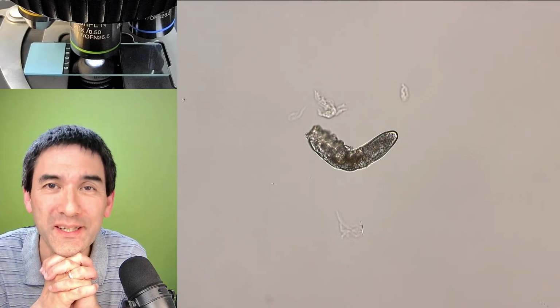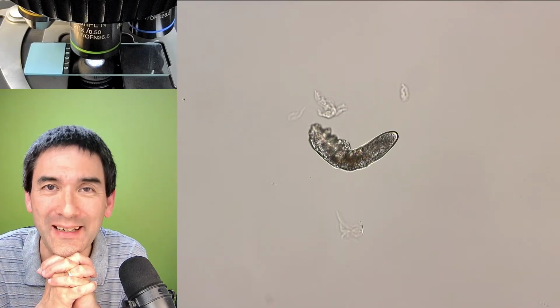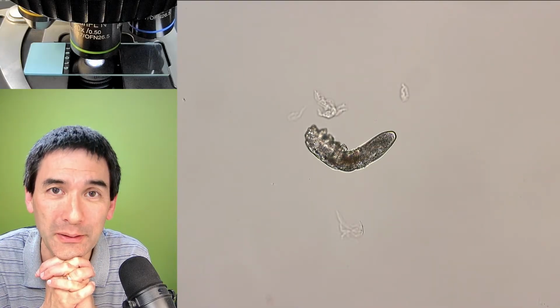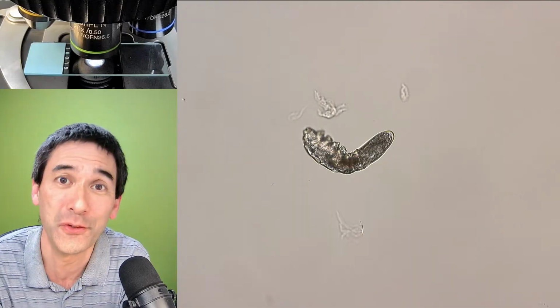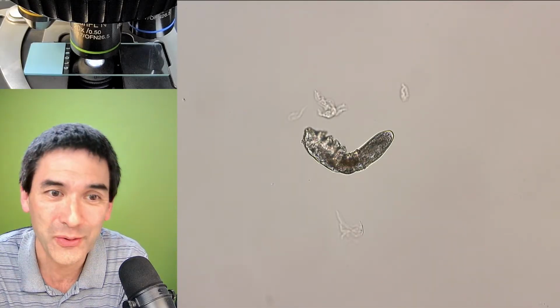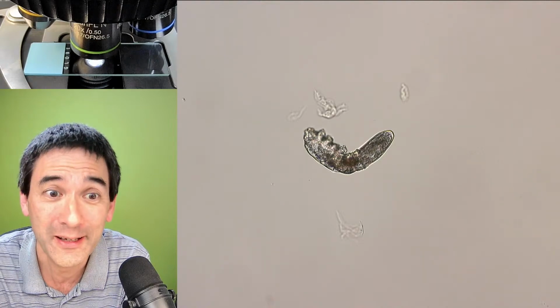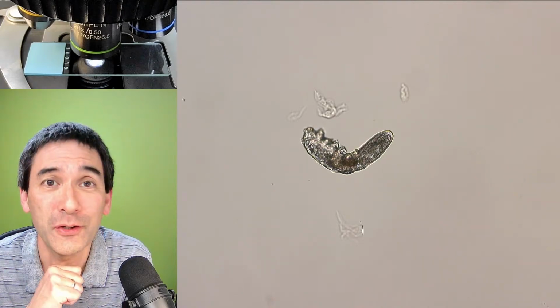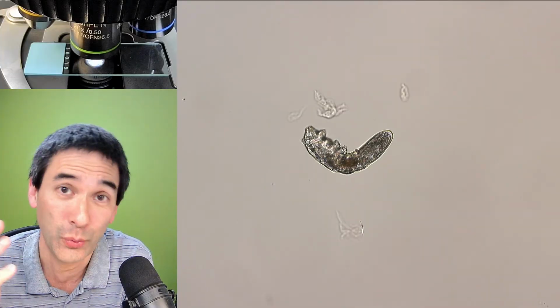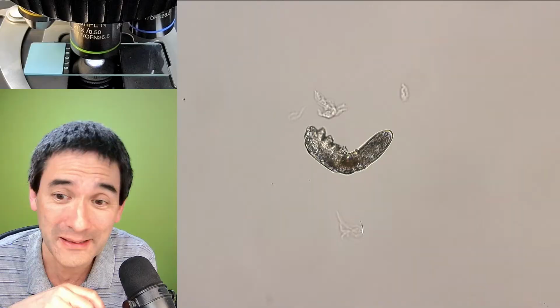Yeah, face mites. That's our topic today again. Not the first time that I talk about that topic, but maybe some of you are not yet familiar with how to catch and observe face mites. So I decided, why not give it another try? As a matter of fact, here on this very microscope slide, I've got 3 face mites. 2 of them are alive. One, unfortunately, did not quite make it.